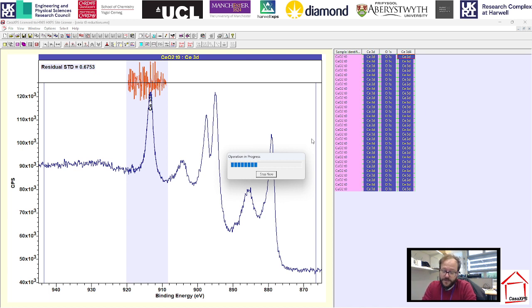And then we'll have a look at the other way of doing this, which is through the components instead of through the regions. But hopefully you can already see what a useful tool this is if you are working with, say, large data sets where you want to calibrate everything to a common feature, to a common function.